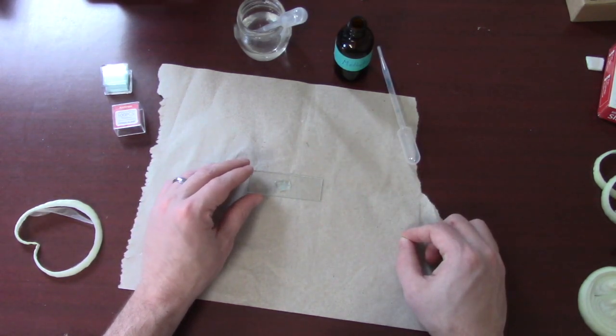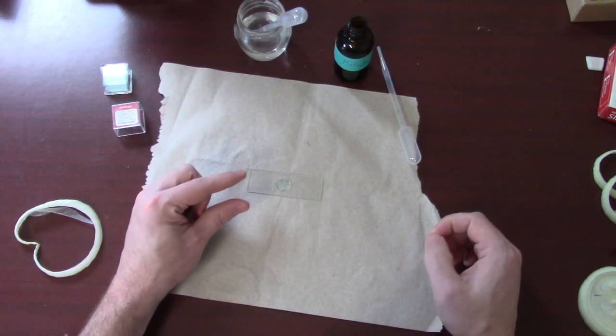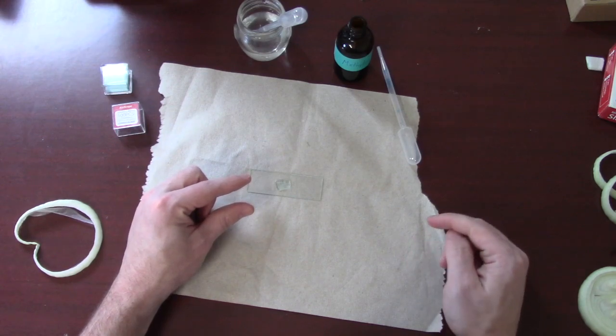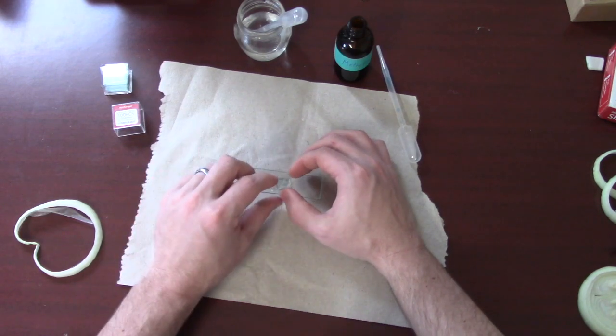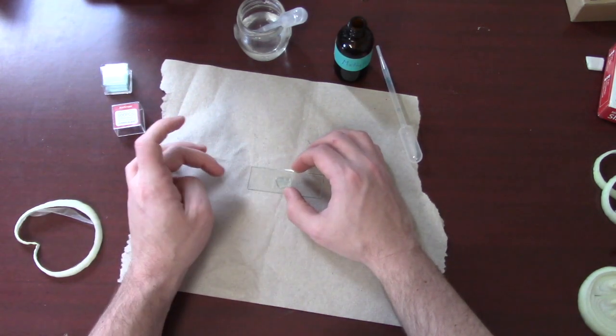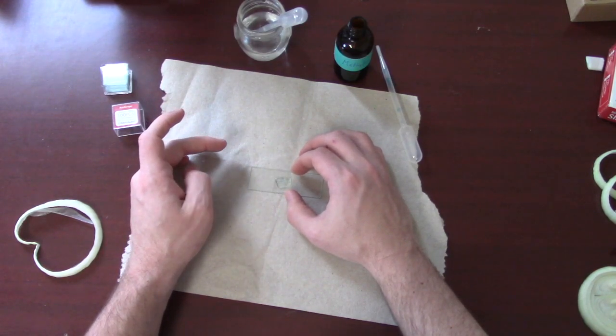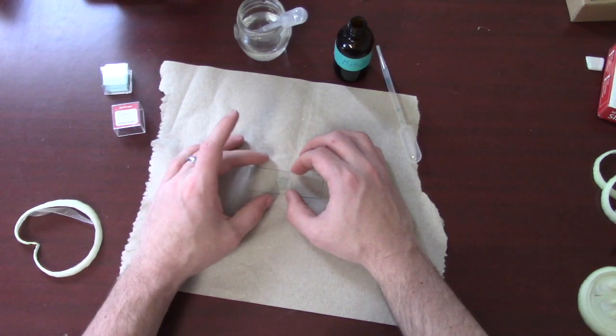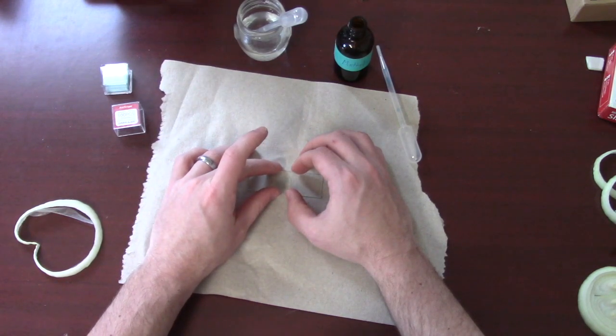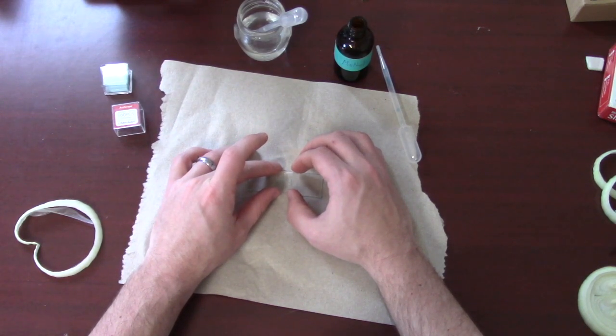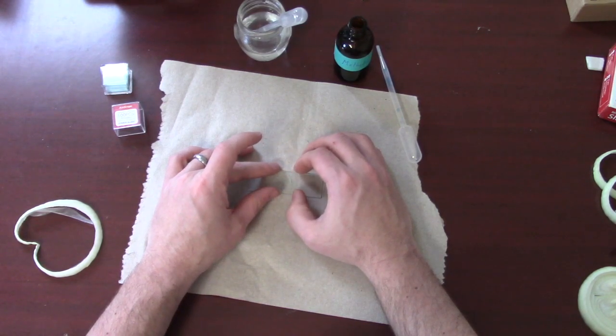The other important thing to remember about cover slips is if you just plop them straight down, you tend to catch a lot of bubbles. And bubbles make it harder to see in the microscope. So, what I like to do is I like to put one edge down. And so now the cover slip is at about a 45 degree angle. So, the left edge is touching the slide and the right edge is in my fingers. And just slowly lower it down and watch that water squeeze out all the air.